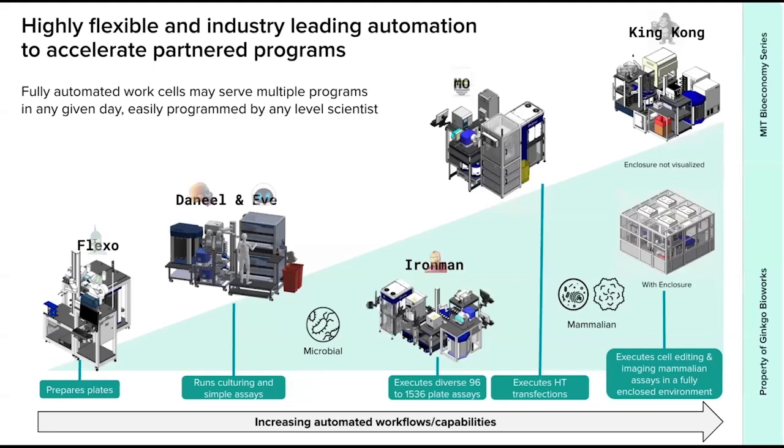All to say, these systems allow us to think differently about how we design an experiment and how we can address greater diversity when we look at a library of enzymes. If we are trying to solve a critical bottleneck in a pathway that we are engineering in a new host, we would love to be able to run a high throughput screen that lets us look at 50,000 unique enzyme sequences in some cases, or possibly 2 to 3,000 with unique experimental inputs and conditions.